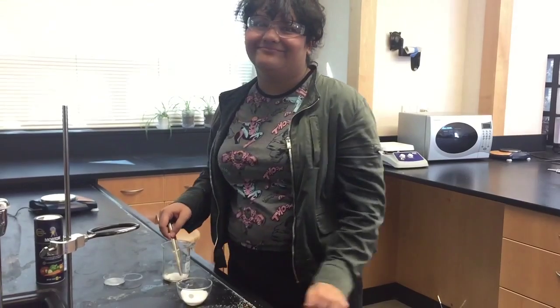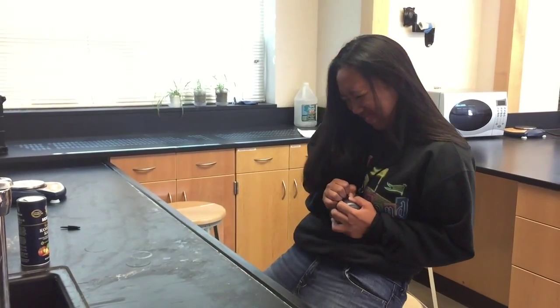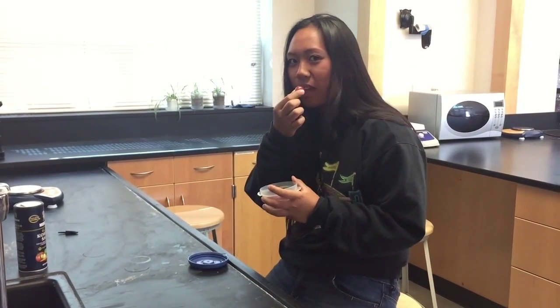Always follow instructions and wait until you are told to begin before starting any investigation. Never eat or taste anything in the laboratory. This includes food, drinks, and gum, as well as chemicals found in the laboratory.